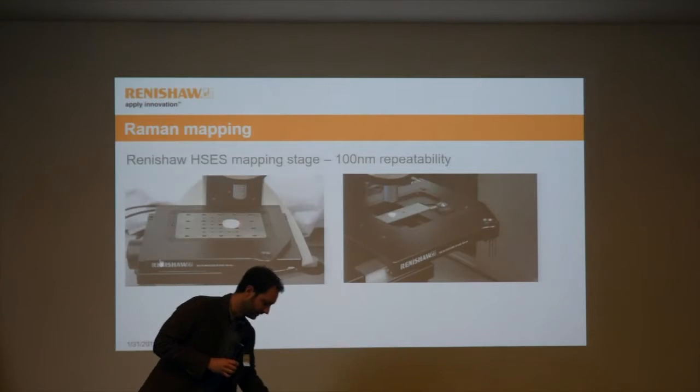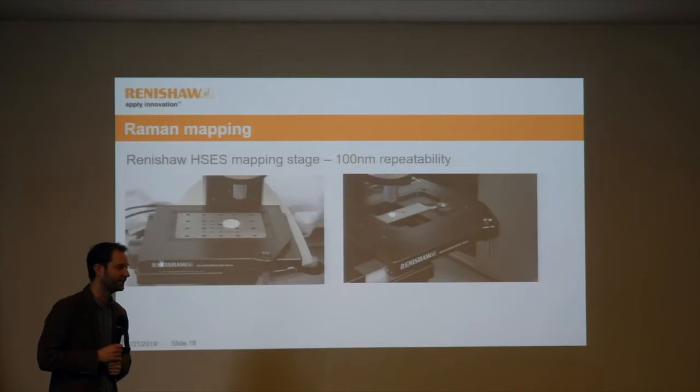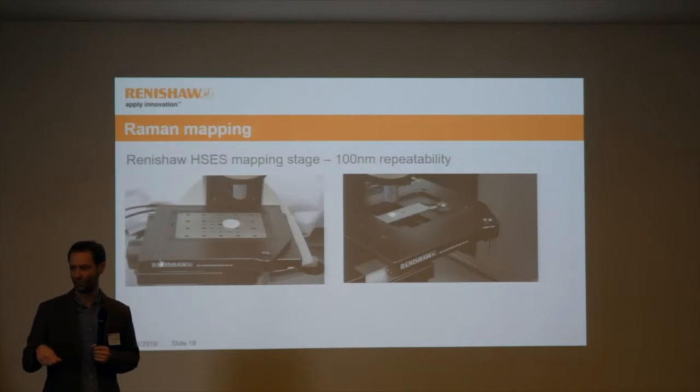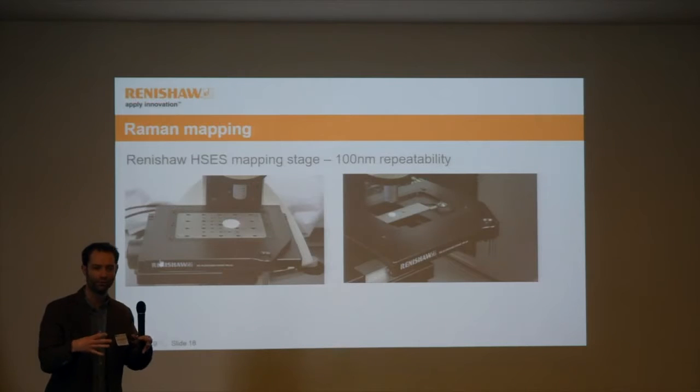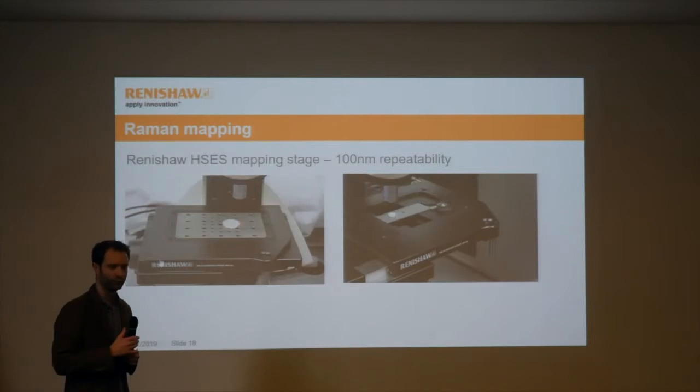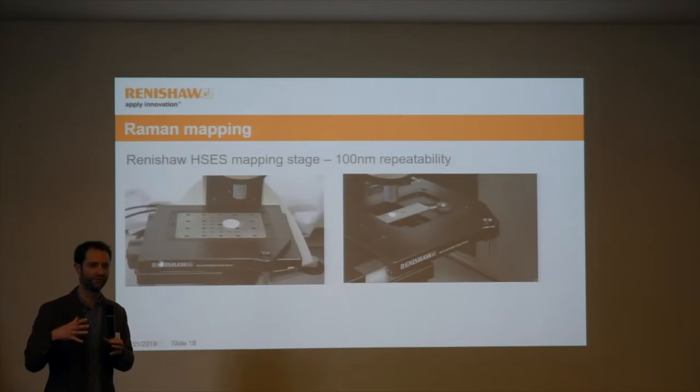And if you have a correct reference mark on your tape or on your sample holder, I think it's reasonable, depending on the repeatability of the stage, to have the sample of interest within the field of view of the objective when you take it from one system to another.